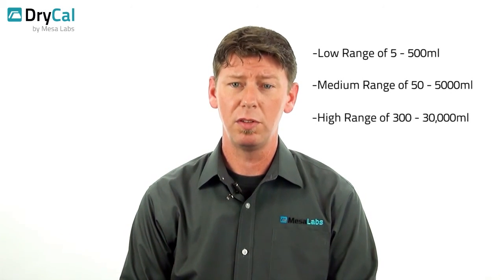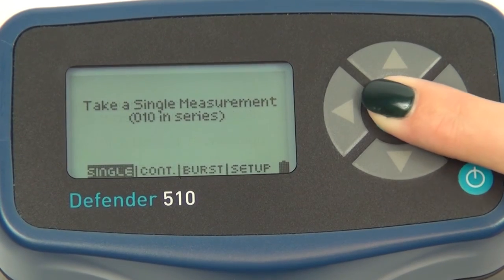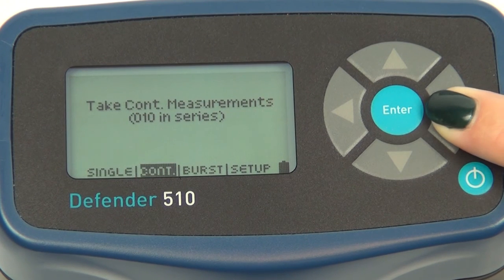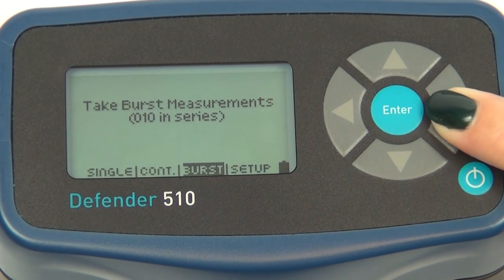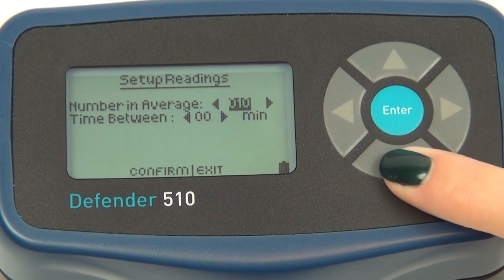Each model comes in three flow ranges: a low range of 5 to 500 milliliters, a medium range of 50 to 5,000 milliliters, and a high range of 300 to 30,000 milliliters. Convenient controls allow users to select single, continuous, or burst readings, and a host of other settings designed to enhance the unit's versatility and value.